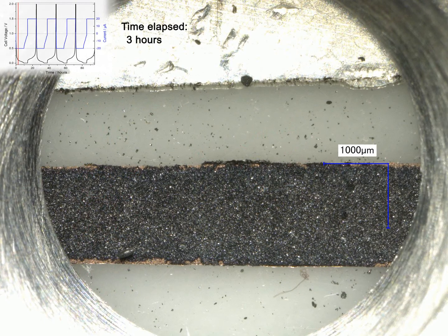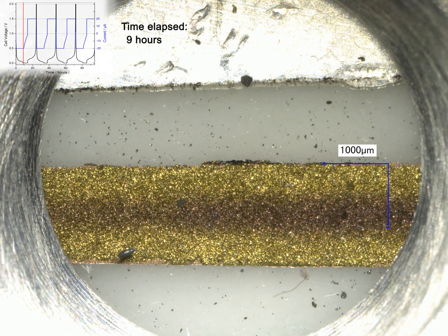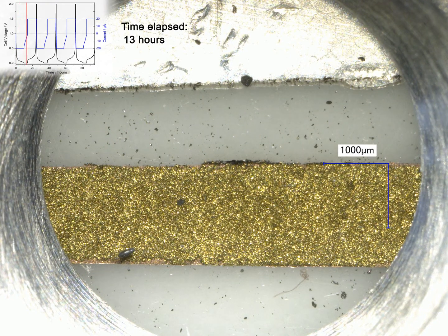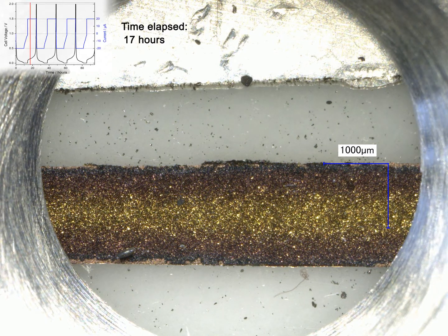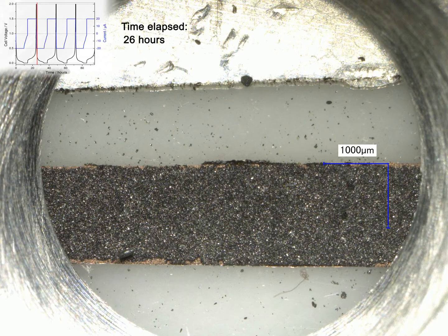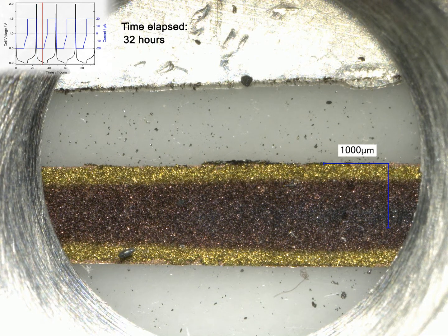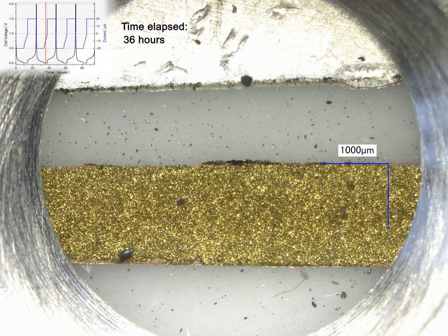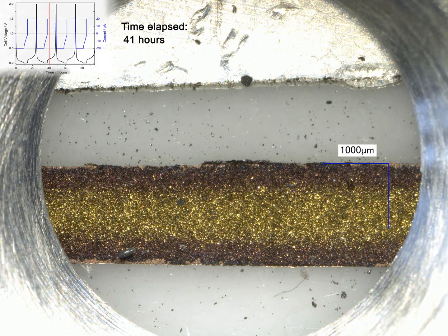The following time-lapse video shows the lithiation and delithiation of the graphite strip during four subsequent cycles. The charge-discharge profile is shown at the top left of the screen, with a red line indicating the current state of charge.